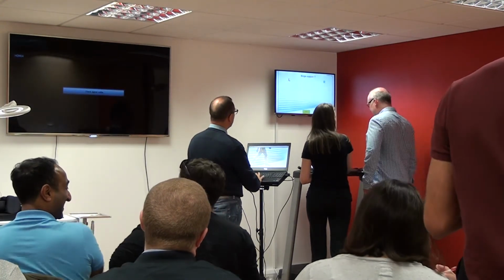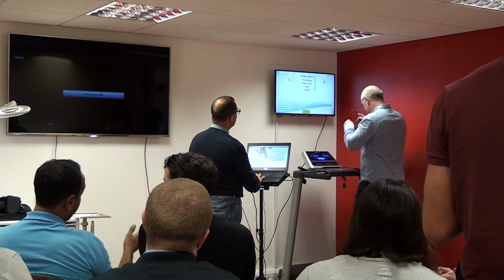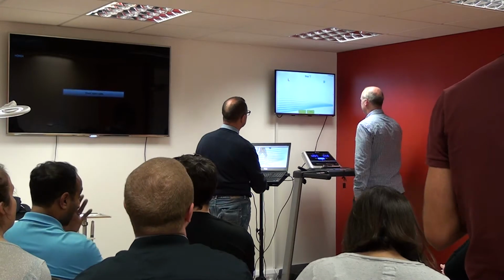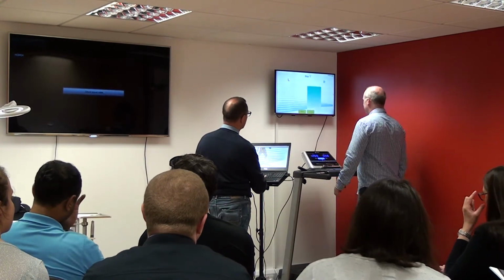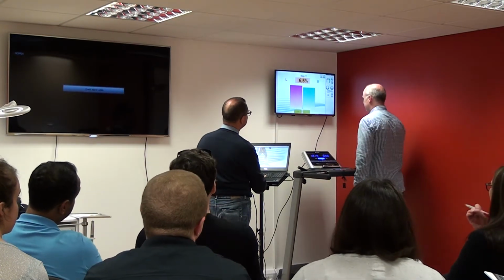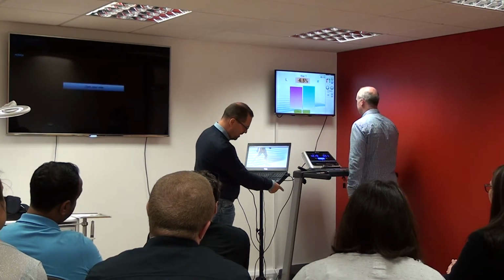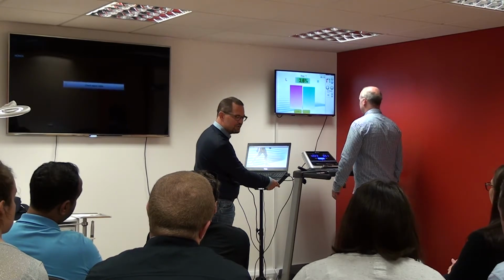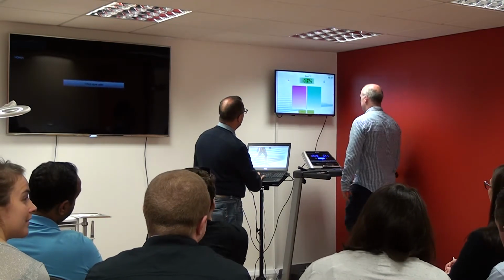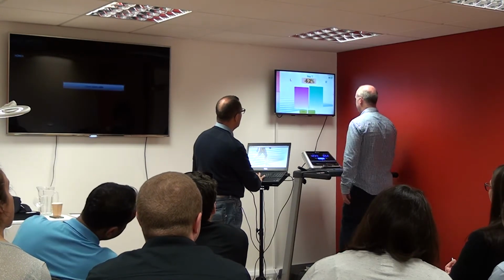And directly here, you choose, for example, the step line. To see if we did it wrong, we have a beep on the right side. So now, yes, it's hitting with the right, and we have the beep. It works. Here we have the threshold. I want to adjust the threshold. Relax the threshold.